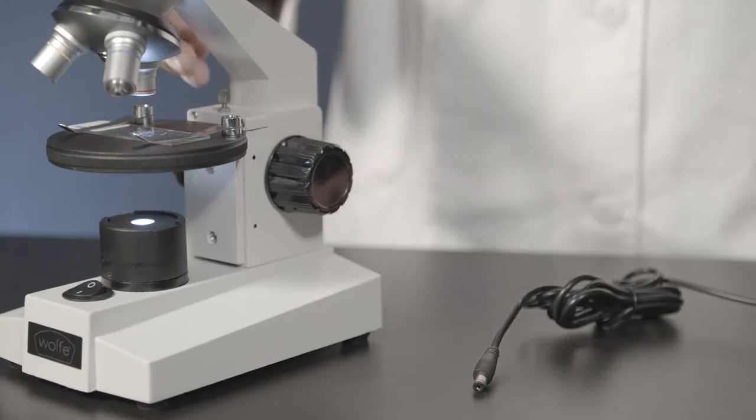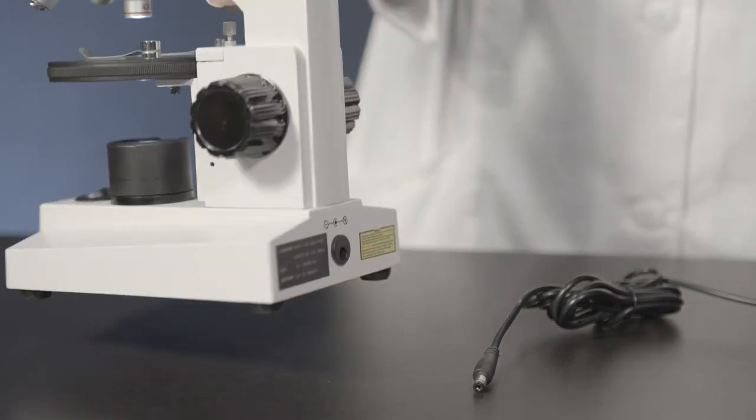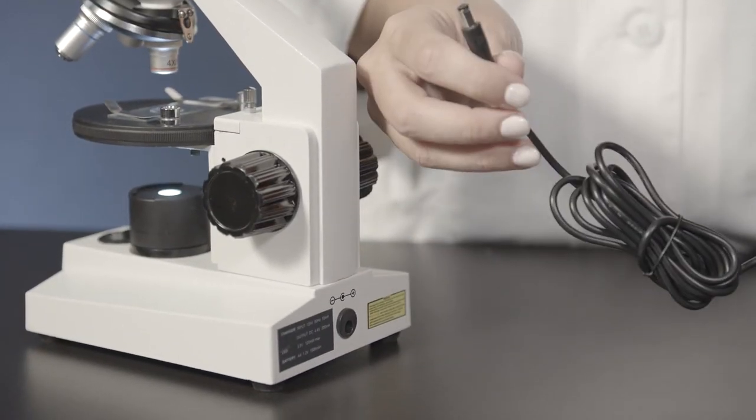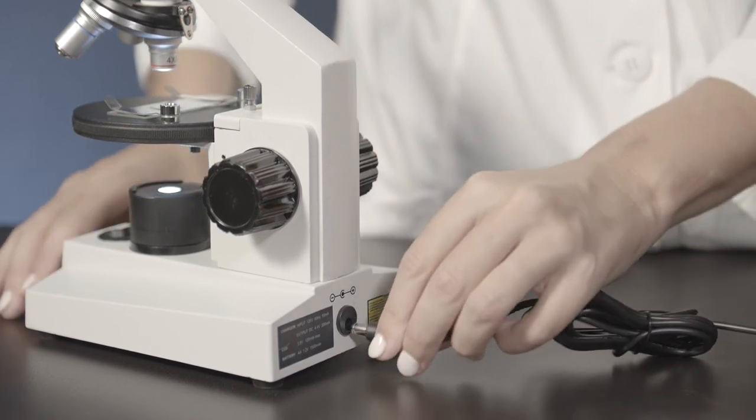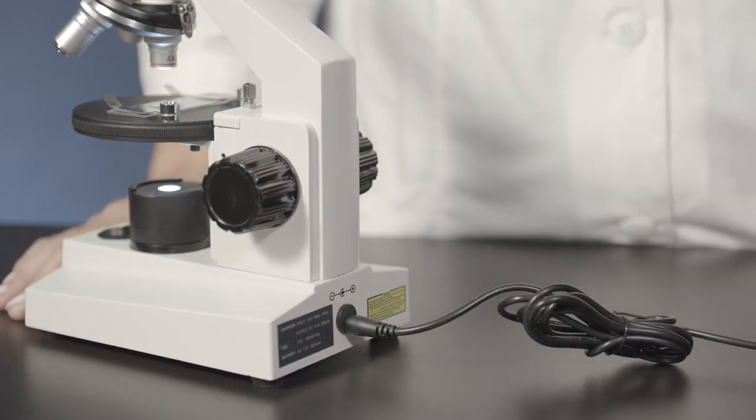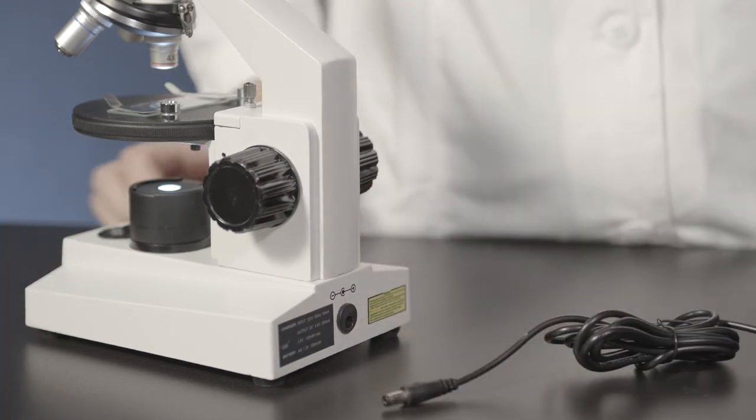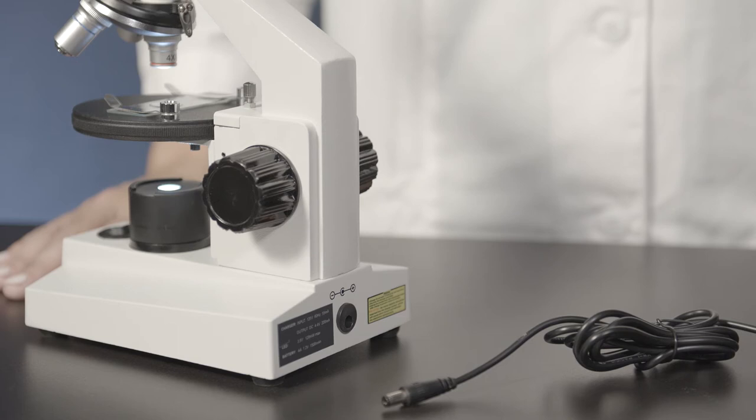The microscopes include built-in rechargeable batteries and AC charger adapters. This feature allows the microscopes to be used at any location in or outside the classroom. The microscope can also be used while being plugged into an outlet, so there is never any downtime.